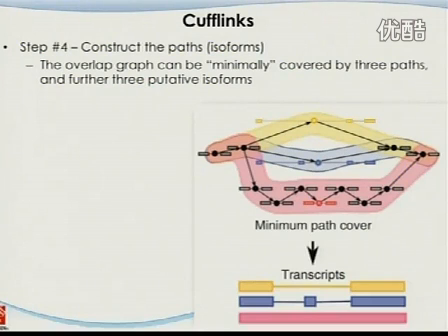The first one represents the yellow one, which is the one where this part is spliced out. For the blue one, you can see there's a small leftover in here, and then there's a potential exon in this region. But the purple one is most likely not spliced at all. All right? Is that all right?